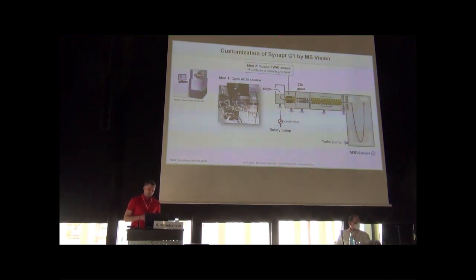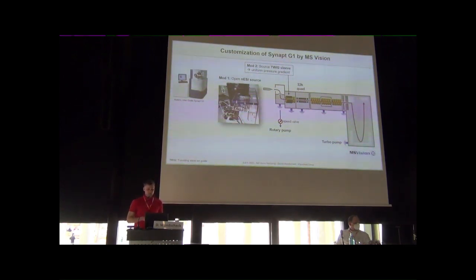Furthermore, we have a sleeve on the traveling wave ion guide in the source region, which helps us to have a more uniform pressure gradient. And we have advanced gas handling for the trap, IMS, and transfer cells, so we can flush all three cells with collision gas and adjust the pressure for each cell. In sum, all these modifications improve the transmission of labile non-covalent complexes.